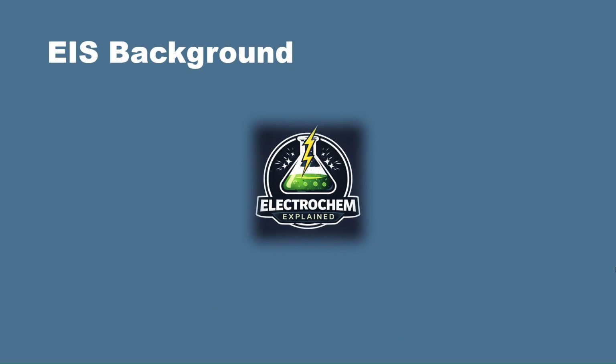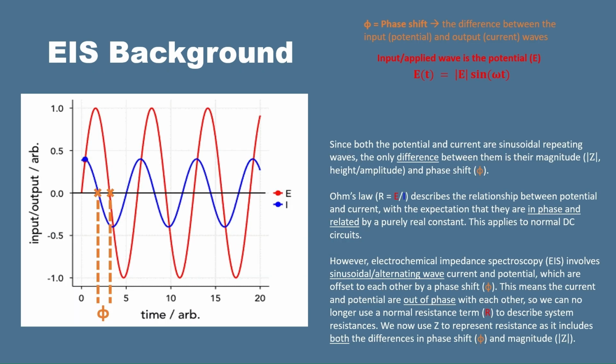Okay, now let's move into the background of impedance. As we know, we apply a sinusoidal potential wave that can be represented by this equation here. And we know that the resulting current is offset by a certain amount. This offset is represented by phi, otherwise referred to as the phase shift. So if we know this is our potential wave, we can then represent the current wave with this equation here, and we include phi because we know that it is going to be offset from the input potential wave.